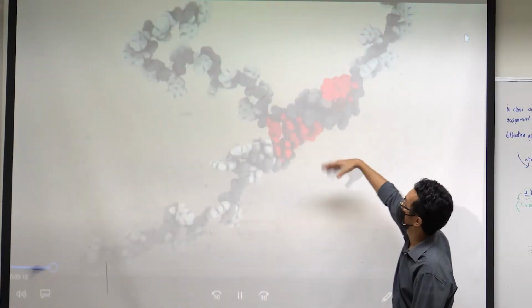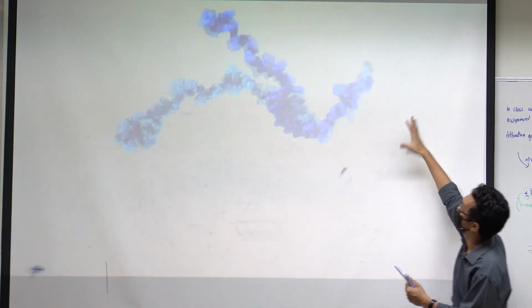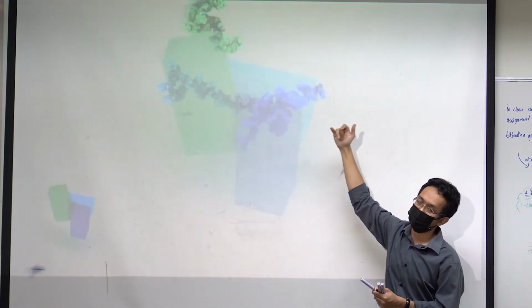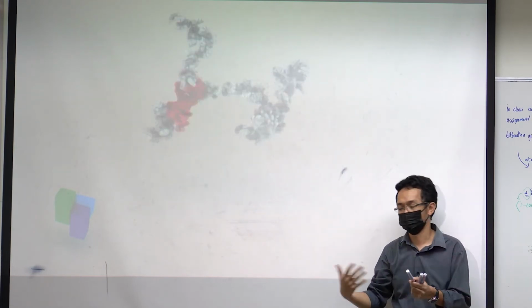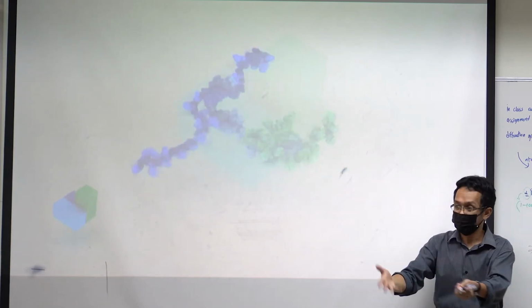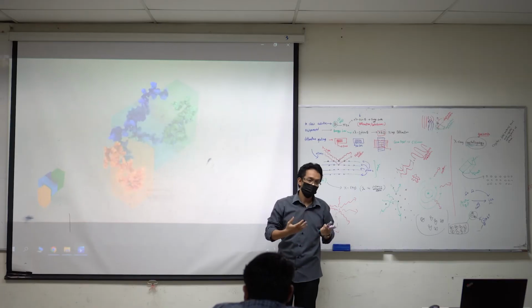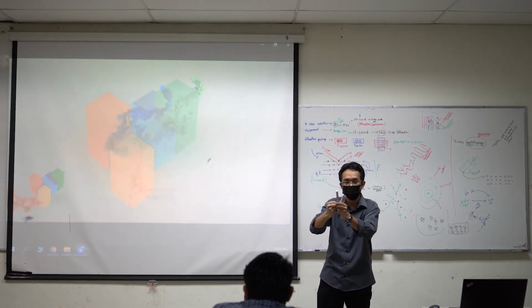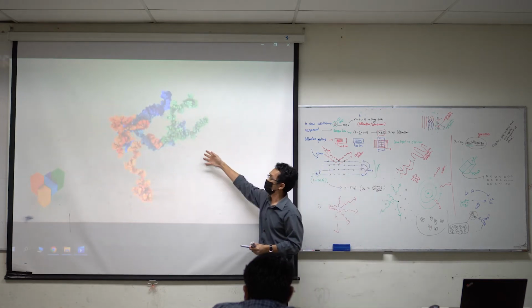So basically they try to mix many DNA together. When you deal with a biological molecule, you need to put it in water, because the physiology is in buffer. If you put the DNA outside like this, it will die, it will shrink. Your protein or your DNA, if you put it outside, it will dry out. When something dries, it shrinks, and when it shrinks, then you don't have a structure. So basically, this is what they do.